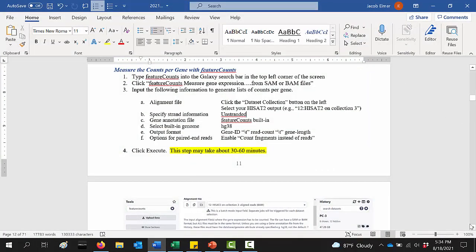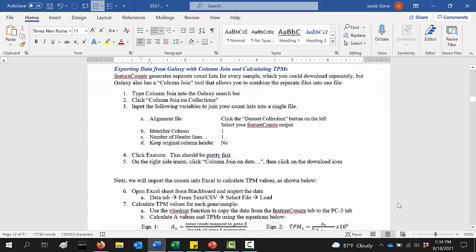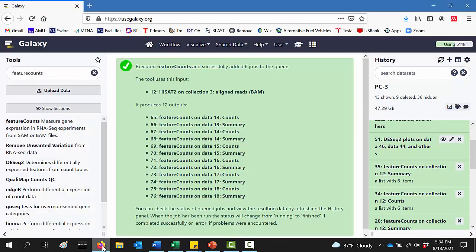with DESeq2. All right, so let's scroll down here in the protocol. Here's where we are. Oh, sorry, I wanted to do one thing before we move on, which is download the count data. This is just a good spot to save what you've done so far, because you certainly don't want to lose all those hours of processing power if, for some reason, you delete this history accidentally or lose power or a server explodes somewhere.